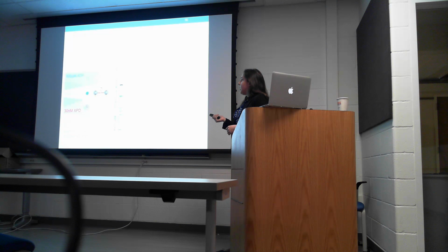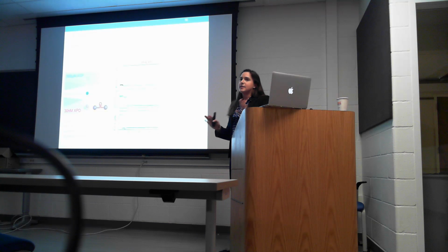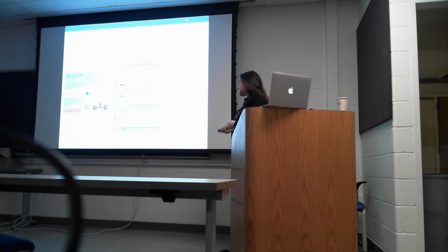No base pairs open, our hairpin is closed at high force. I then lower the force and incubate in XPD for about a minute. I've covered up the number of base pairs open because at these low forces, the calculation is inaccurate. The force is so low, it should be closed. Then moving into ATP, I increase the force, and as soon as XPD is exposed to ATP, it begins to unwind, and we see this activity.